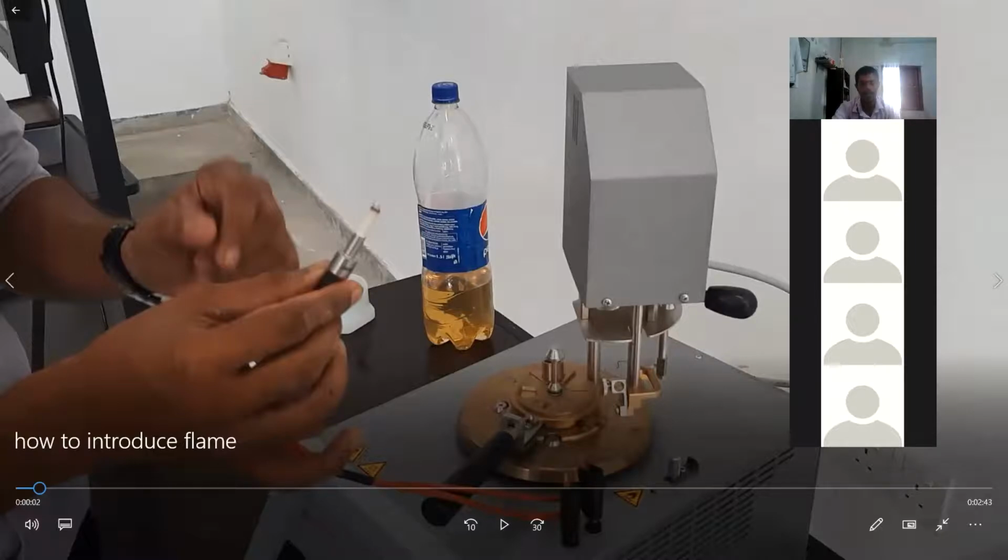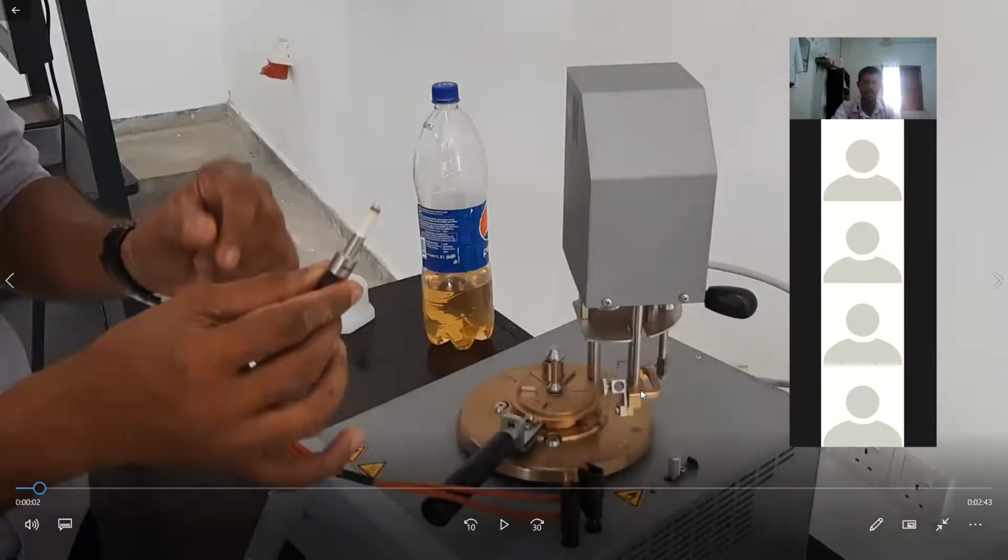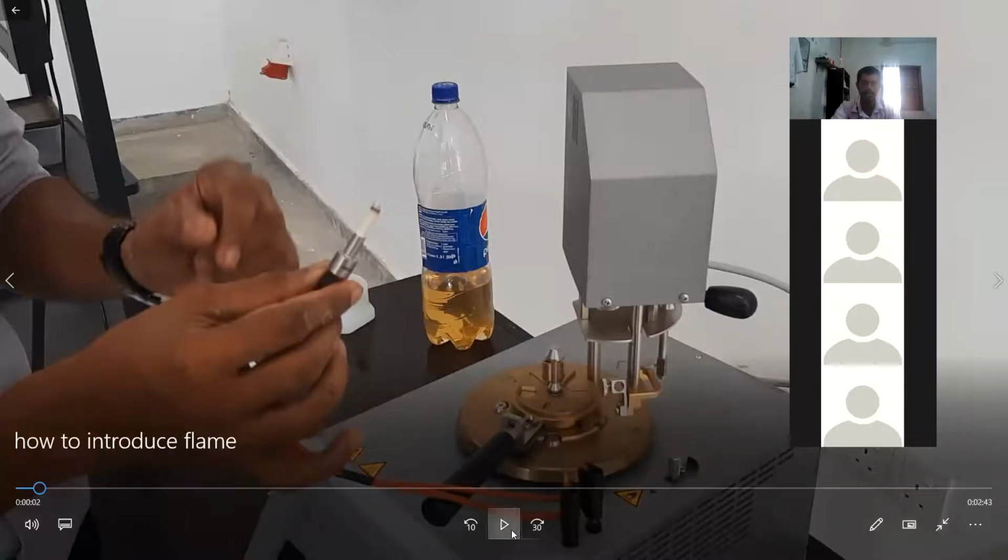If we switch it on, there will be a flame on this electric heater. Then we can introduce it using this lever, right? We don't need to introduce it by hand. We can fix it, and there's a lever. By moving the lever, we can introduce it, right? I will show you. See.